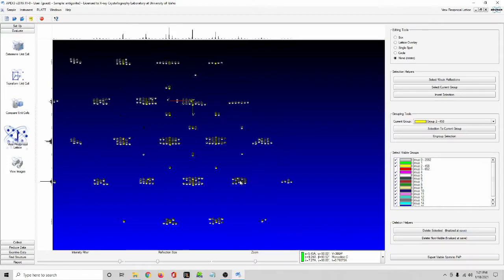This next row I might skip because there's not enough information, even though it's probably that one. Let's try it. That line looks pretty good. Yeah. Okay. Let's try to refine that now.